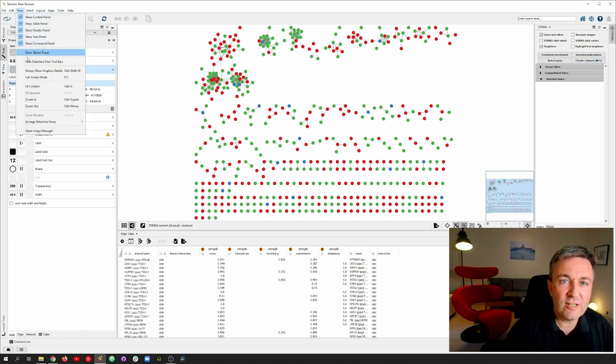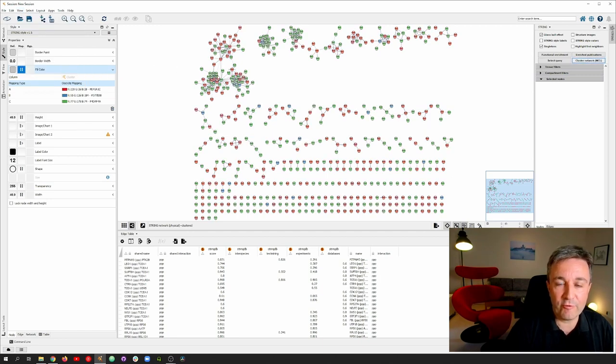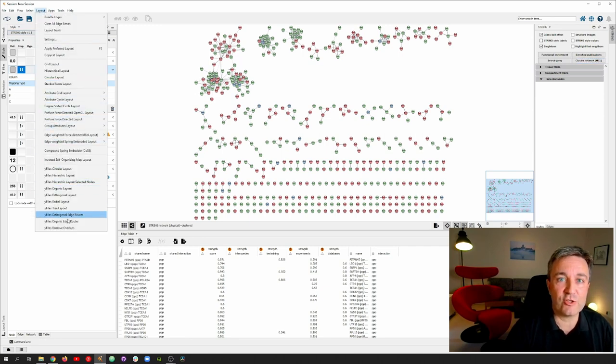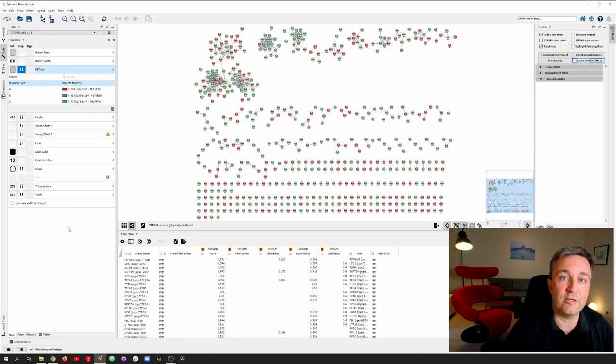You still see a little bit of overlap of nodes. For this, we use the Y files layout algorithms to remove overlaps, slightly adjusting the layout without altering it overall.